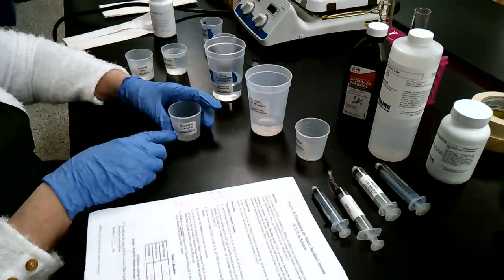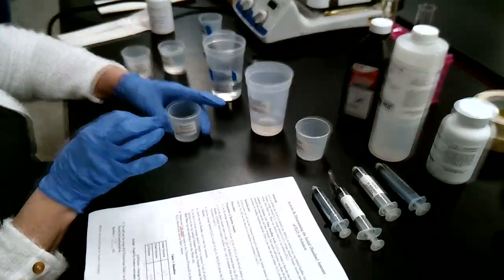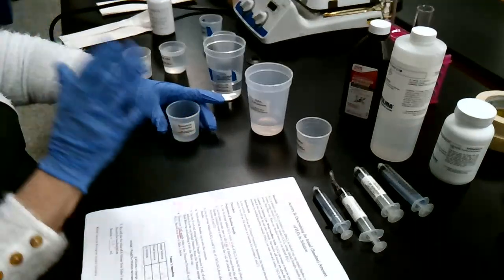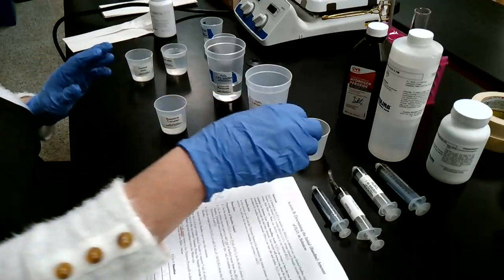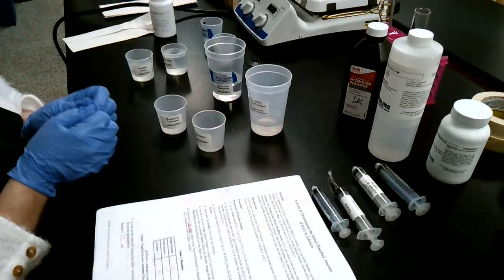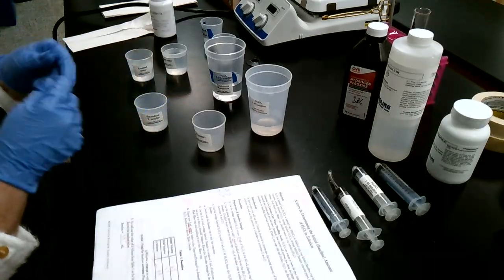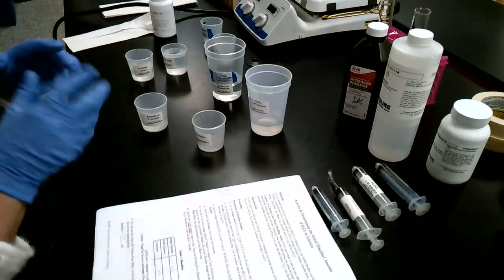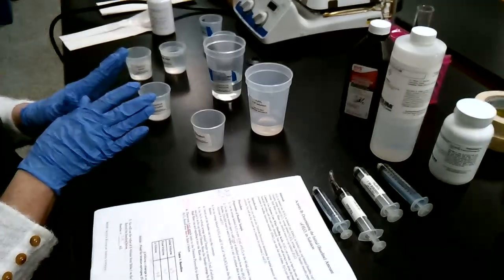So now my baseline is done. I have 10 milliliters of hydrogen peroxide. Then I squirt the milliliter of water in, and now I've killed it, even though it's not an enzyme. We know. So now what I've got to do is titrate this. But I'm not going to titrate all of this. And even when you do the timed things, say this is your 10 seconds, because after 10 seconds, you squirt it with the acid and it stops it. Or after 30 seconds, you squirt it with the acid and it stops it. And then it can sit there for a while because it's all stopped.